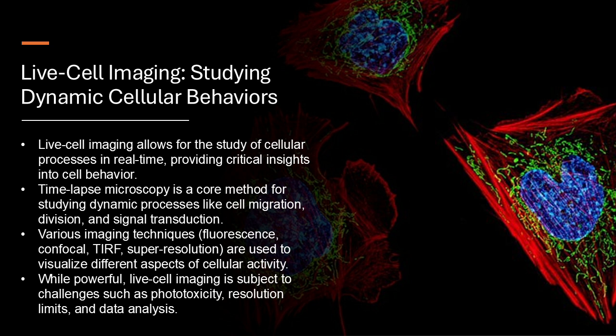Imagine taking a series of pictures over time and then stitching them together to make a video. But instead of a blooming flower, we're watching cellular processes unfold at high speed. We can see how cells migrate in response to signals, the whole process of cell division, even programmed cell death, all in this dynamic sequence. So it's like stop motion animation, but with real life cellular drama.